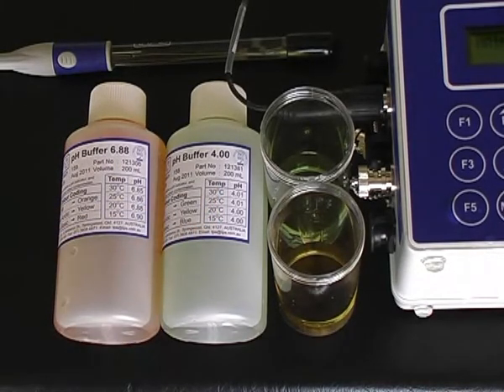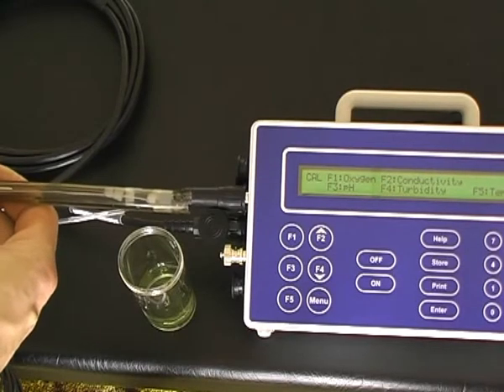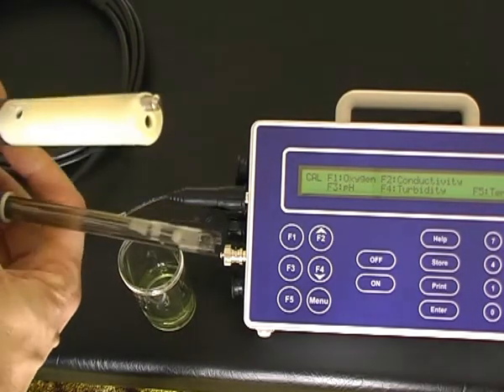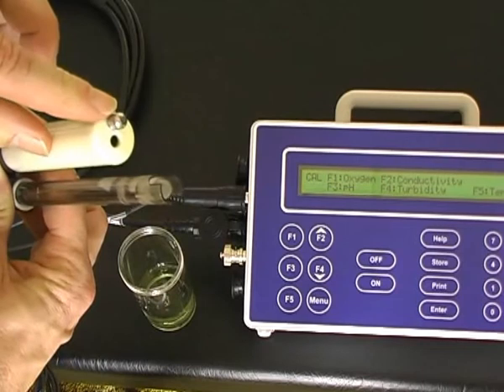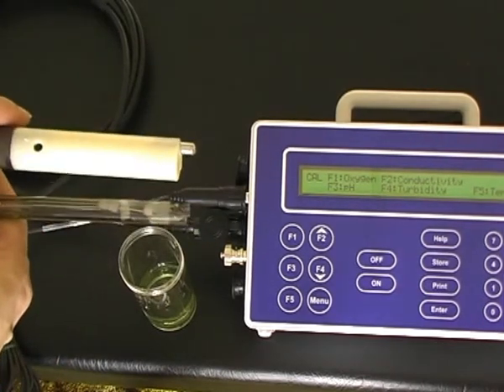I've poured those solutions into another jar so that we can place the sensor in there for calibration. Ensure the sensor is submerged at least 30 mm in that solution. To calibrate the pH sensor, you must also include the conductivity sensor, which has a temperature sensor on the end of it. Both sensors must be in the solution at the same time.